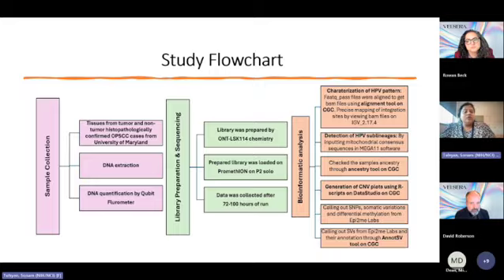FASTQ-pass files were aligned to get the BAM files using the alignment tool on Cancer Genomics Cloud. Precise mapping of the integration sites was done using IGV. Detection of HPV sublineages was done in software. The sample's ancestry was checked and confirmed by the Ancestry tool on Cancer Genomics Cloud. Copy number variation plots were created using R scripts on Data Studio on CGC.